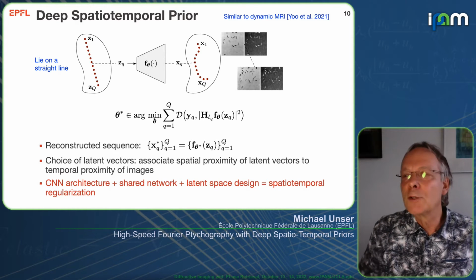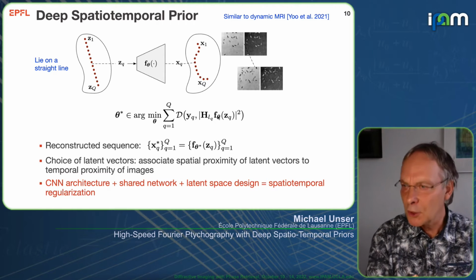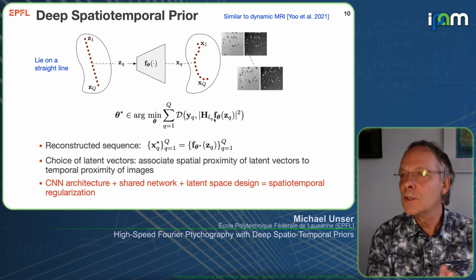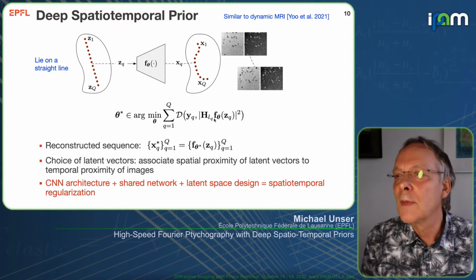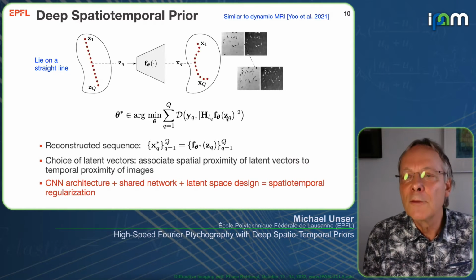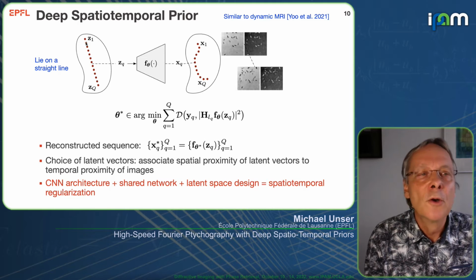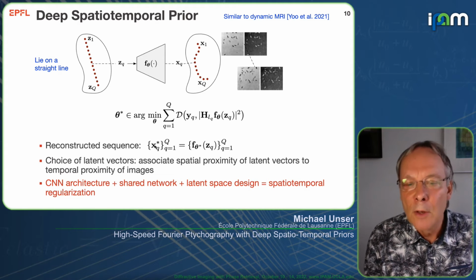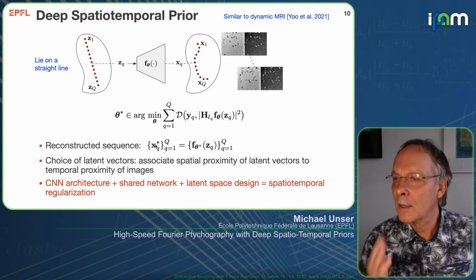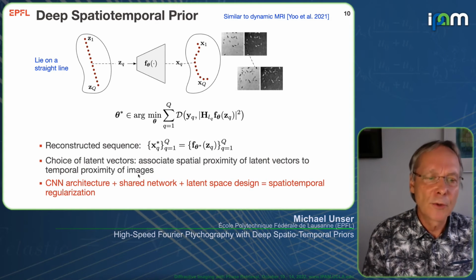We train the neural network to adjust its parameters so that it produces outputs that are consistent with the measurements. At the end, if we apply the trained neural network to each of those inputs, we are able to generate the time sequence at a finer rate, with high resolution as well.